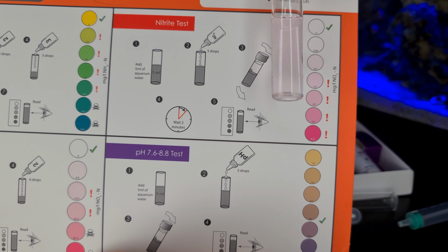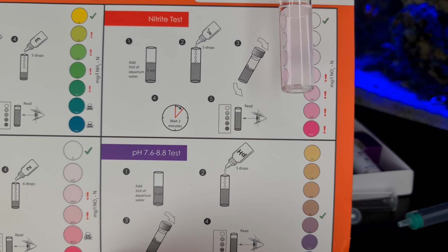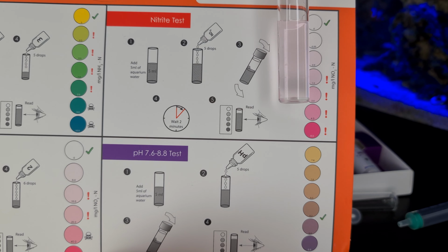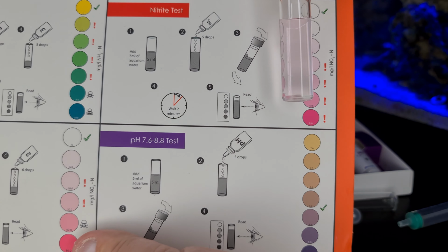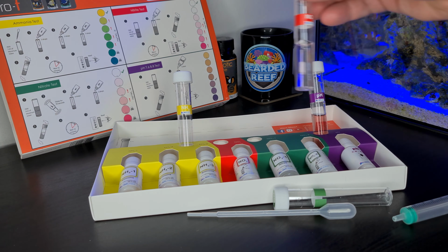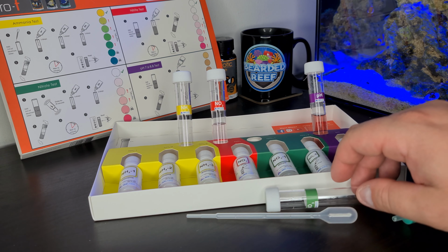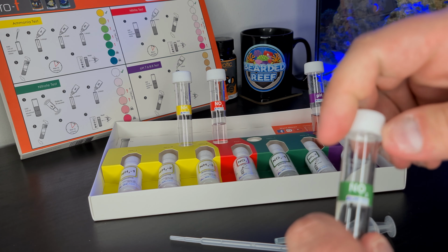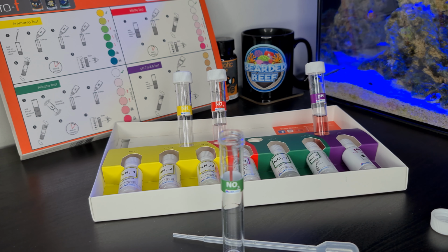Yeah, I think according to that, let's say my nitrites are 0.5, which I'm a little bit surprised about. I wouldn't have thought they were 0.5, but yeah, that's what it's saying for that one. So 0.5 on the nitrites for that one. Again, quite a simple one to do, so I'll stick that back in. And then last but not least, the nitrates. So this will be an interesting one to see what the nitrate shows up. Like I say, I usually do the Salifert test, so we'll see how this compares.